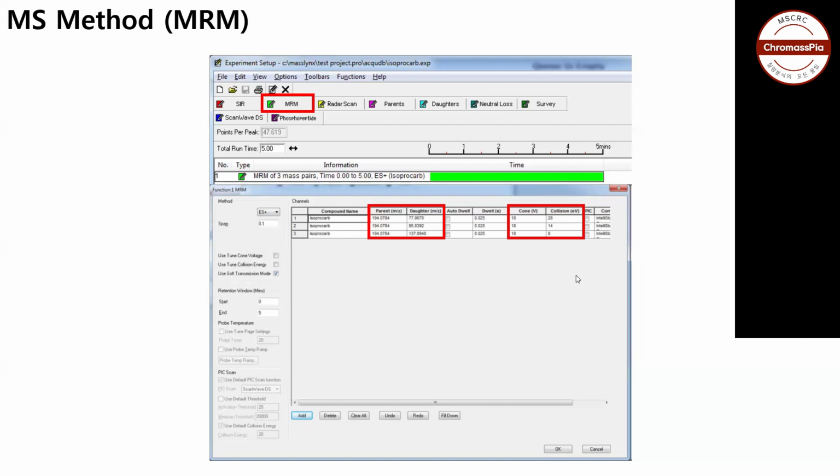Yeah, I understand, but I think it will be a ramp energy, in this range. As you can see in this one, cone voltage is fixed, but collision energy is changing. So at these particular values like 28 and 18, we will get the highest intensity of the 77 daughter first, and then it goes by ramp. Yeah, it is like ramp energy.